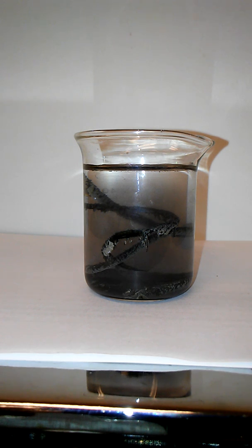But anyway, if you look closely here, and I know my phone's in the way a little bit, you'll be able to see it in better detail on the video later, you can actually see that the paper clips are not as thin as they used to be, and that's because just like the copper metal with the silver earlier, they are getting a coating of silver on the wire. It's not sticking to the wire very well here the way it does on the copper, and so I'm actually seeing it rain off quite a bit. But if you look closely here, you can see bits where it is shiny, where you can see shiny silver crystals growing on the iron wire there. And I just used paper clips for the iron wire here.